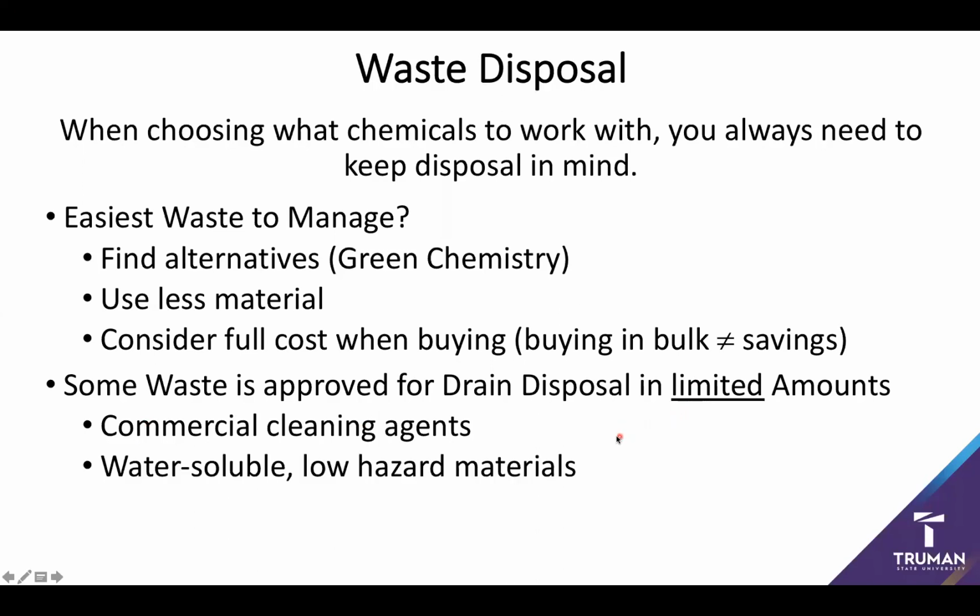Most of these materials tend to be water soluble, so they can enter the cleaning system. They tend to be very low hazard materials, or materials that quickly become non-hazardous as they react with water. Some biologicals can go down the drain, say something like a simple agar, but make sure they are not infectious, nor can they become infectious.